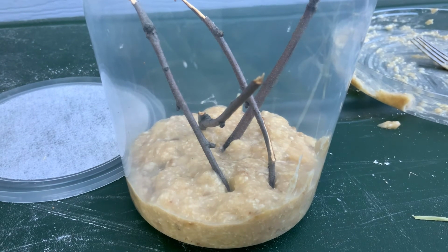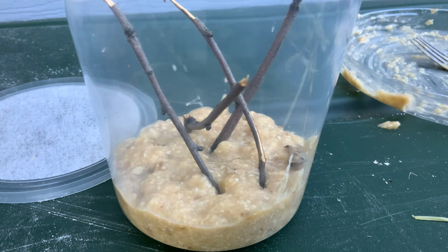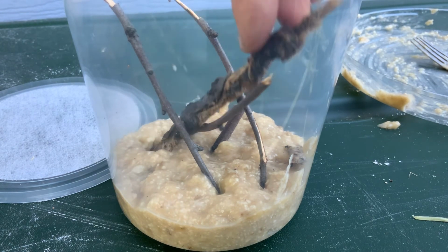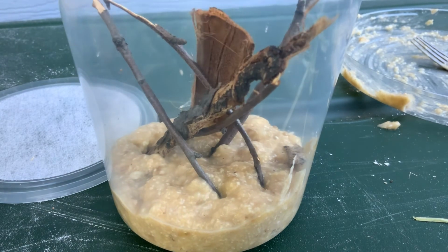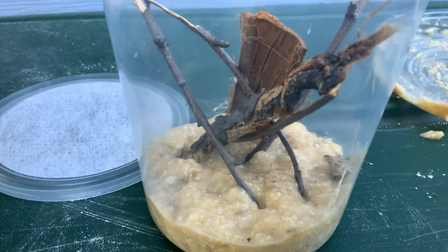Something I thought would be useful is some wide pieces of bark, kind of like this. Don't know if it'll fit. No, it's too long. One sec. Let me cut it to the right size. There. You can just use normal scissors to do that. So they have a surface to pupate on, and that's the only reason I'm doing this. Otherwise, they wouldn't need all this stuff in there. There, just like that. So they have a surface to pupate on.